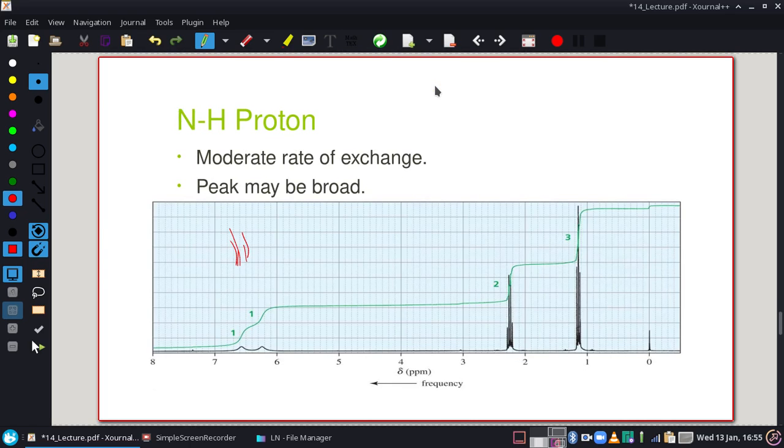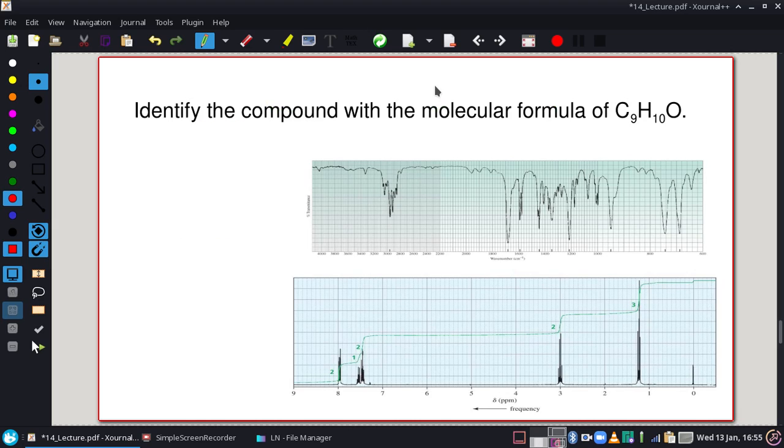All right, last little thing, since we just finished up proton NMR, I'm going to give you a loose idea of how we go about utilizing this on proton NMR. All right, so now we're not going to fully identify this. I'm just going to go through. I don't want you to view this as just how to identify it. I want you to utilize this to identify the steps you're going to take. All right, so there are a few things we're going to guarantee that we know based on what we're given when we're given multiple things.